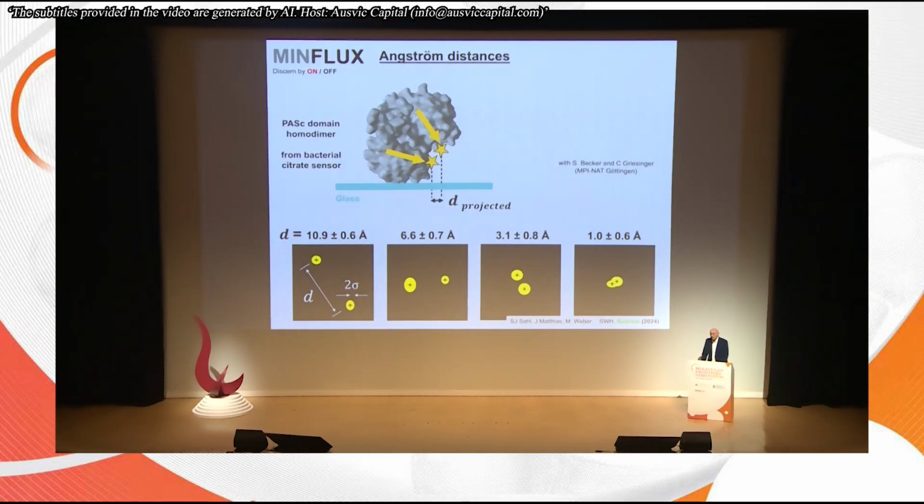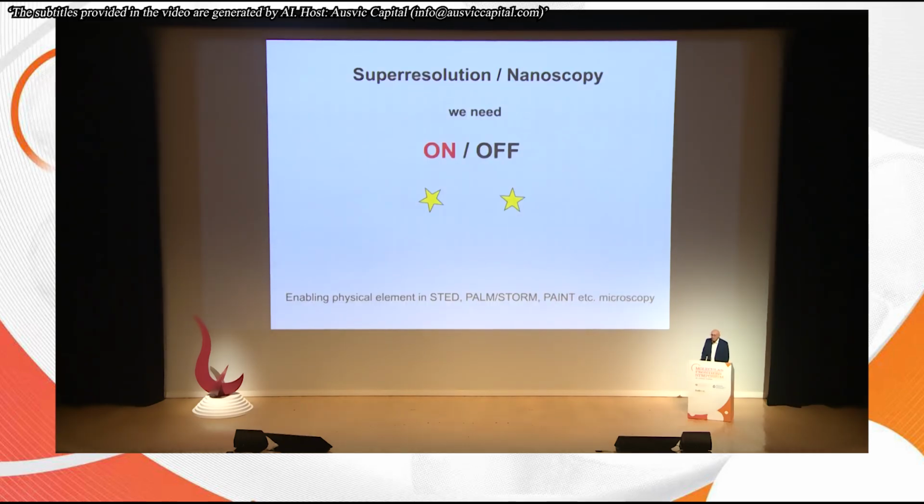And this really shows that what people call super-resolution fluorescence microscopy or nanoscopy has really come down in resolution to basically molecules touching each other, basically down to nothing. Now, all done with focused light and objective lensing, and for me it is very satisfying to see how far this journey has actually taken us, basically down to molecular scale.